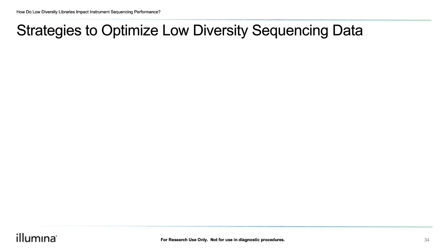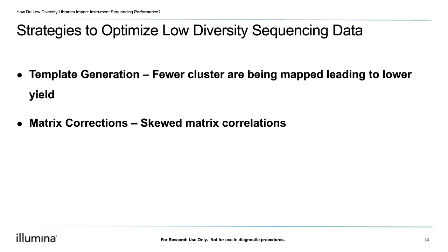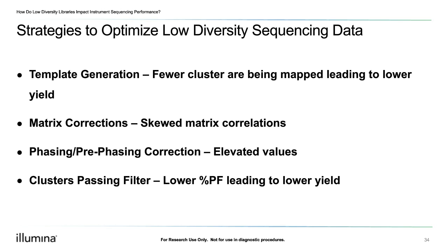To summarize how low diversity libraries can impact instrument sequencing calculations: first, fewer clusters are typically mapped, resulting in lower overall yield. Because we may not have signal from all bases during matrix generation, low diversity libraries can result in a skewed matrix calculation. Phasing, pre-phasing, or both may be elevated. Low diversity libraries can also result in a lower overall yield, and we may see lower quality scores as a result of the impact of low diversity libraries on all of the above calculations.